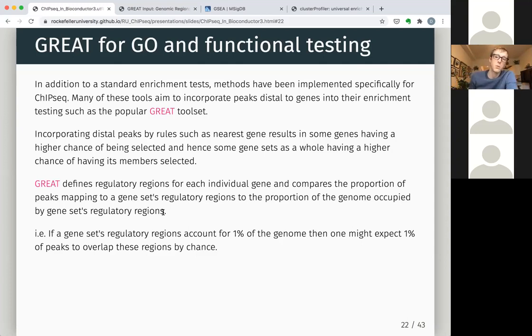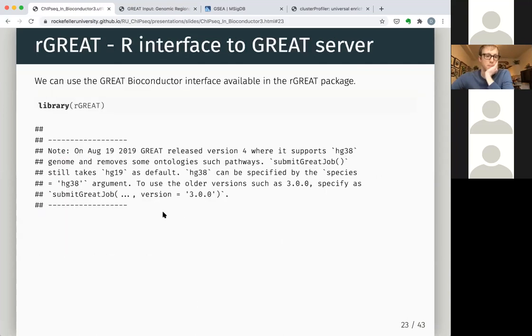So it's basically a way to get a longer gene list, and you don't even have to use the enrichment from GREAT for the annotation. You can just use GREAT to get your gene set and then use that in Cluster Profiler if you want. So it can just be a way to annotate, and then use other tools to enrich. There is a user interface you can use, but there's also a nice Bioconductor R package that we're going to use today. So we'll load that in.